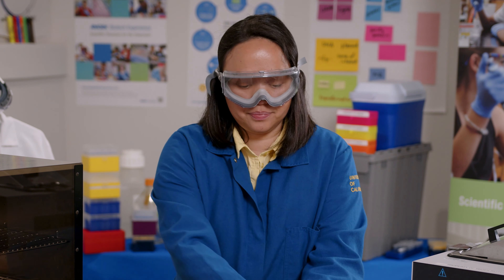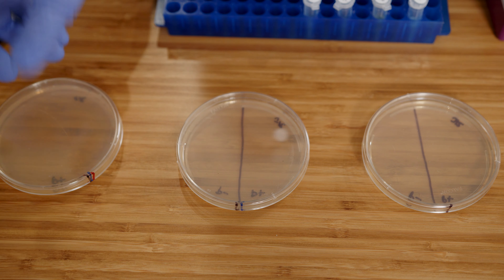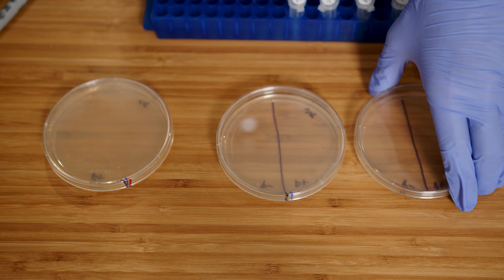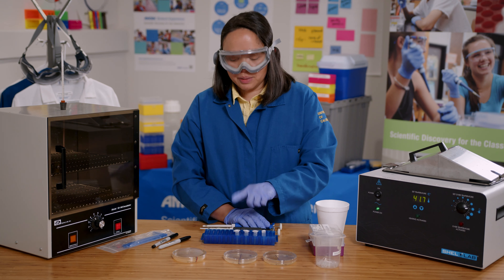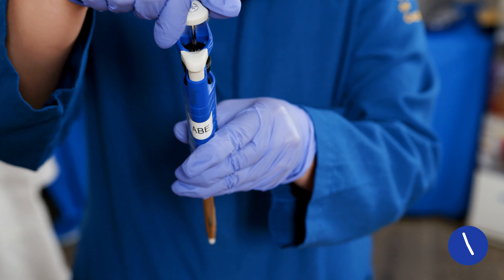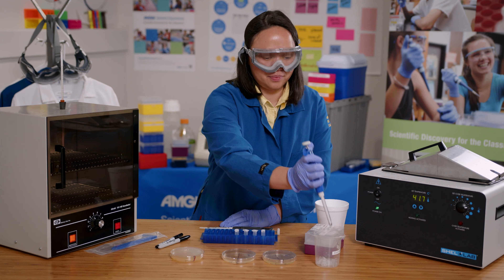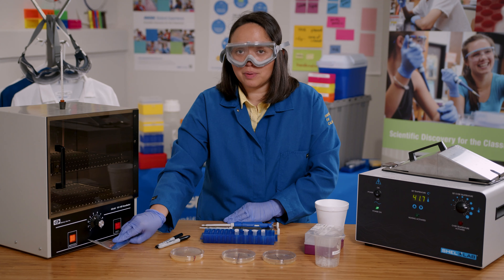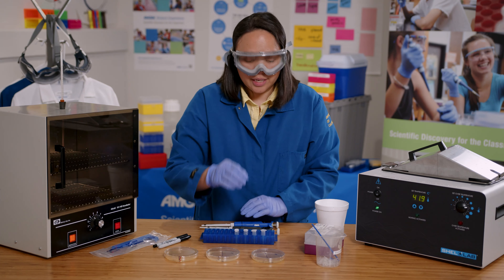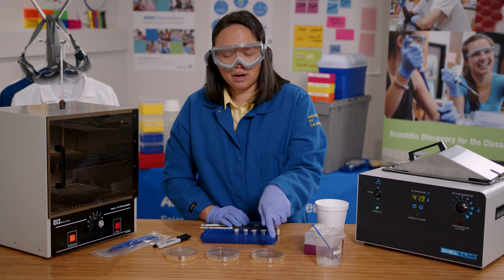Now I'm ready to plate the cells. Anytime I open the lid, I will only open it slightly and on one side like a clamshell, and close it right away to prevent any unwanted contamination. I'll start with the P- tube and pipette 50 microliters onto the LB and LB amp plates, then use a cell spreader to spread the cells on the LB plate first and then the LB amp plate, because I don't want ampicillin to get on the LB plate.